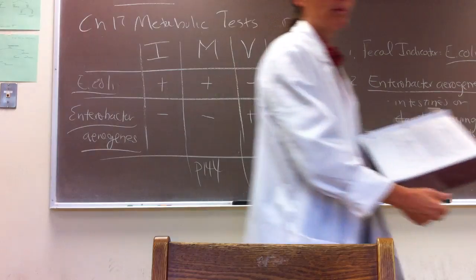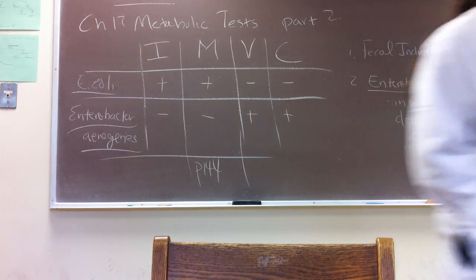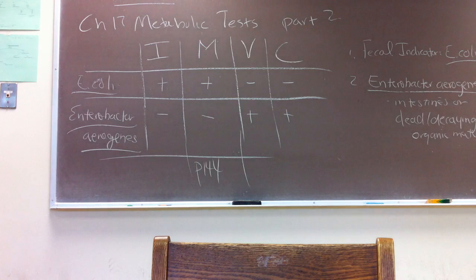Okay, so you guys remember that you inoculated your high glucose methyl red medium, and let me see here. Let me just go grab some samples back here really quick. We have set up some practice guys for the metabolic test.